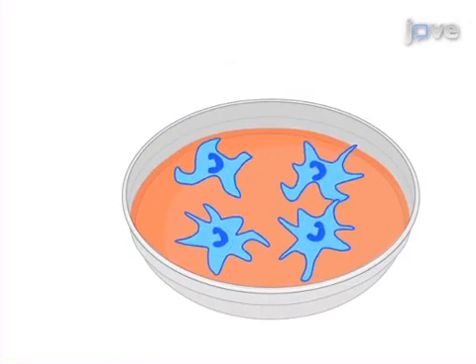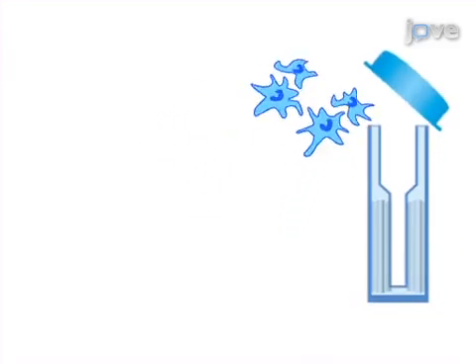The second step of the procedure is to detach the premature THP1 macrophages.